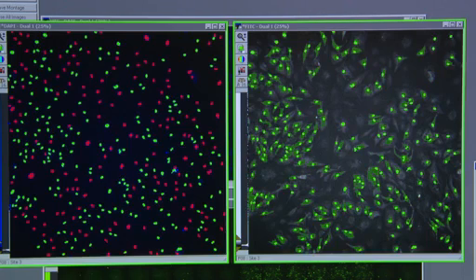In contrast to the traditional methods of measuring adipogenic differentiation utilizing dyes such as Oil Red O, the assay described in this video utilizes an antibody against lineage-specific protein, fatty acid binding protein 4, to confirm adipogenic differentiation. In doing so, this method quantifies changes in gene expression that correspond with adipogenic differentiation.